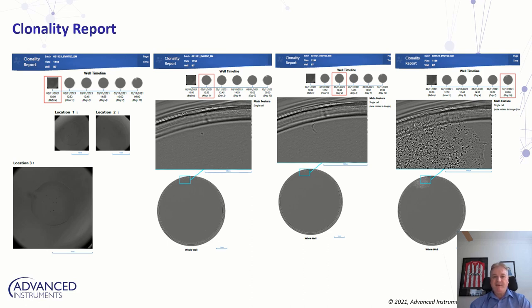And then we have typically the day 2 image, or the 24-hour image, where the cell has gone adherent and divided into 2 cells here. And then we could show over here on the far right images of the colony as it's growing. You see it around the edge of the well there, and you can actually choose what images you want from the time course to include.